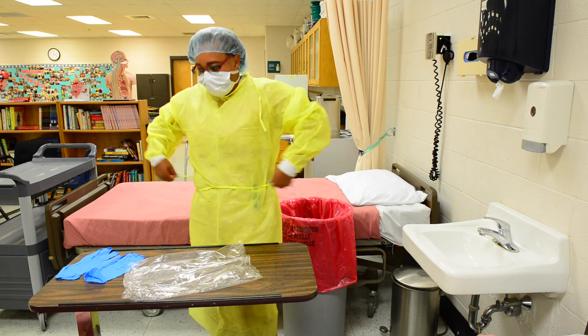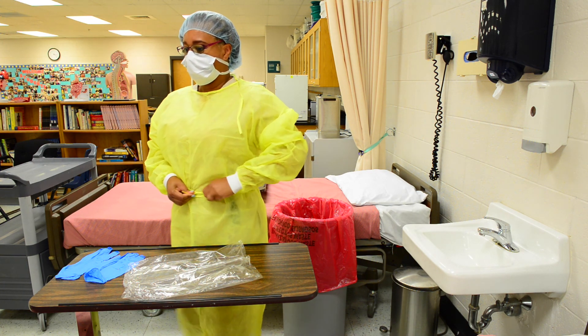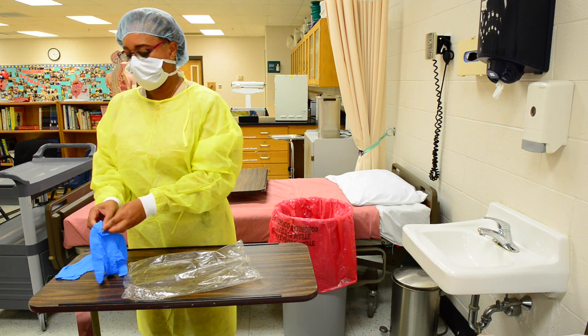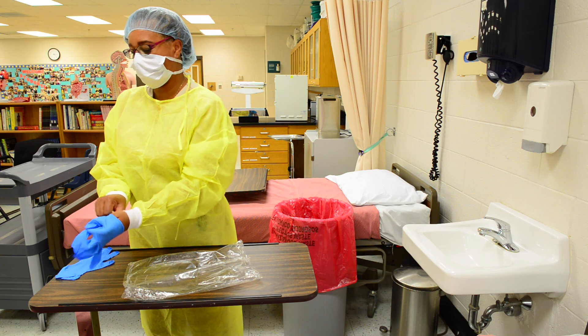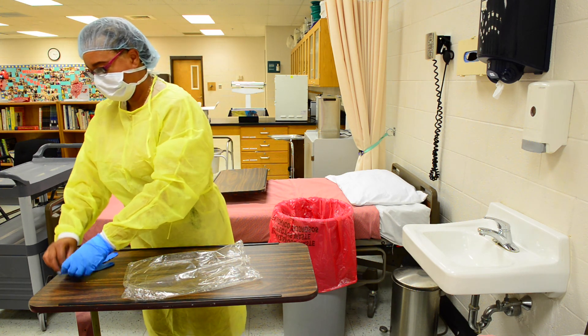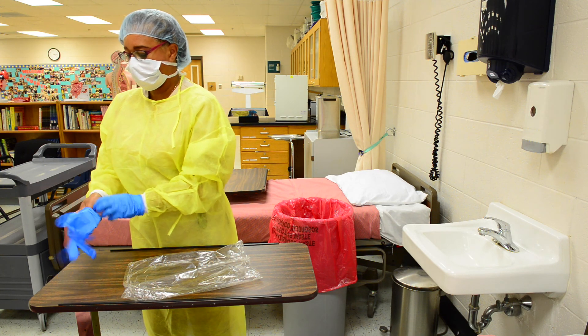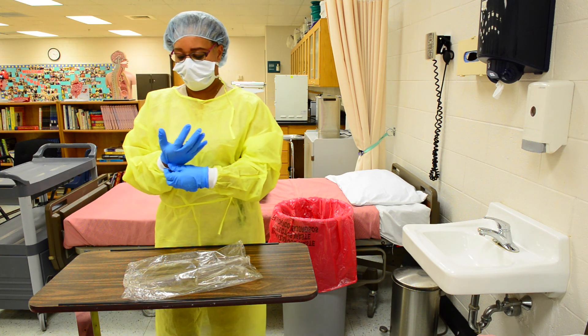Apply the gloves lastly and correctly. This is to protect you and or the patient.